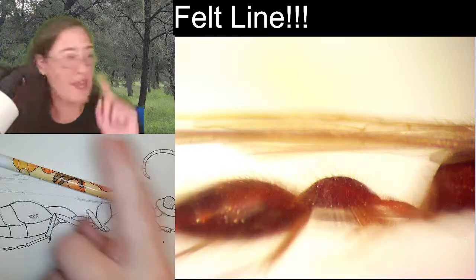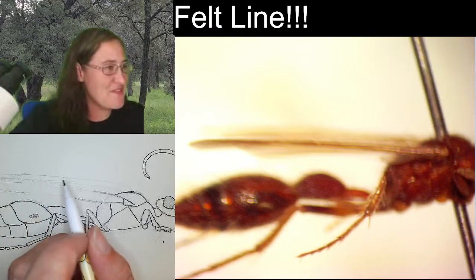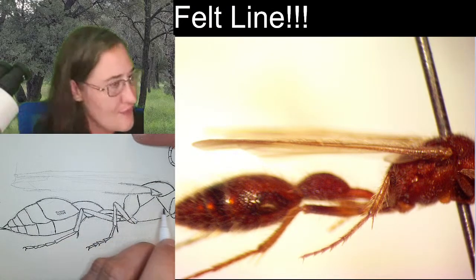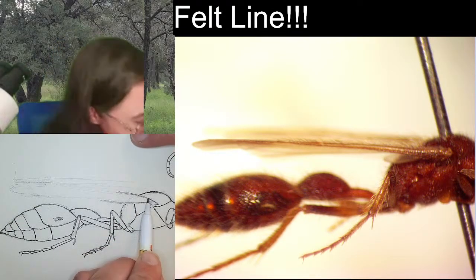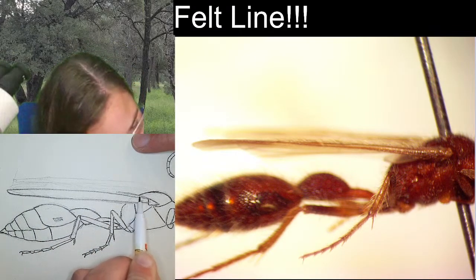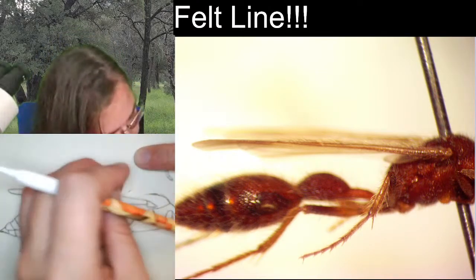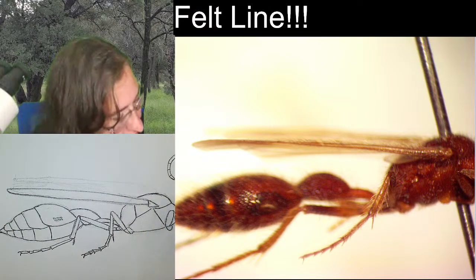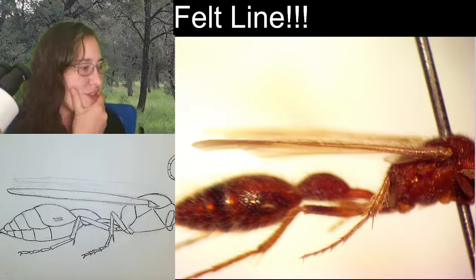And you know what? I pinned this velvet ant so well that these wings are so flat that I might just leave them as these flat wings here. It does have four wings.